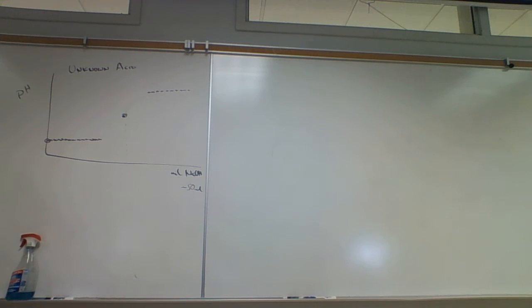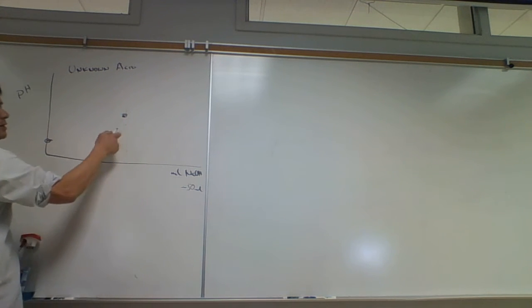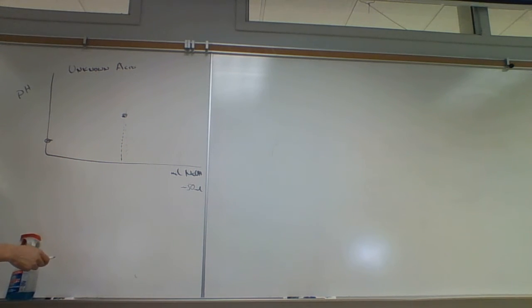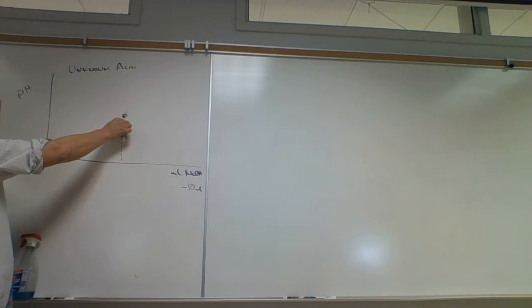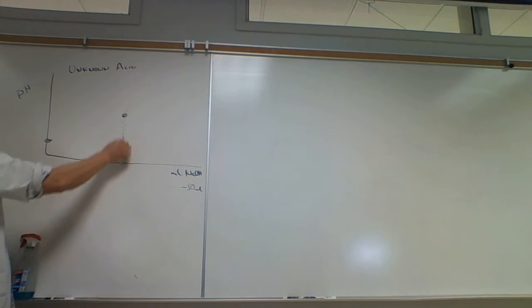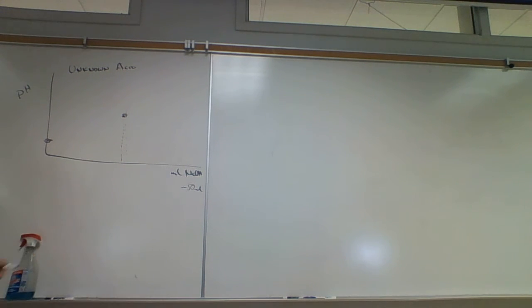And so we're going to do one trial titration in which we just take one piece of data. That one piece of data is, where did that phenolphthalein change color? And if we know where that phenolphthalein changed color, that's got to be close to the equivalence point, right? And so we're going to just do a regular standard titration in which we just monitor the phenolphthalein color. Once we know about how many milliliters that took for how many grams of acid, then we can do a simple calculation to figure out where it should be in our pH titration.